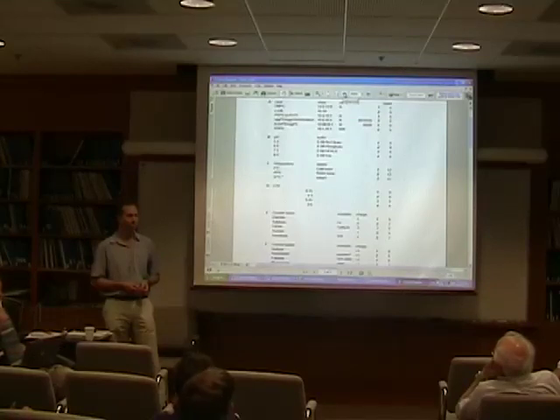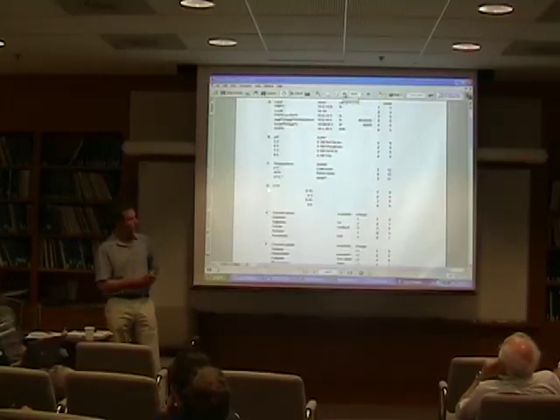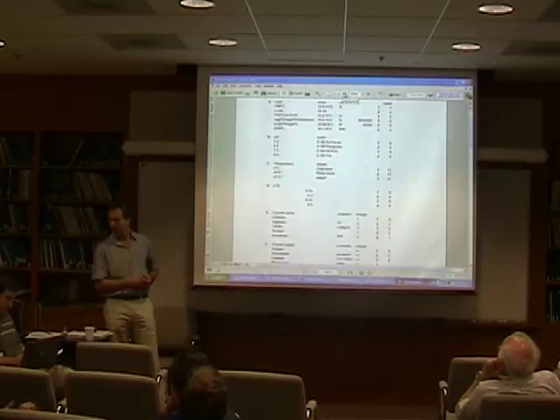Well, the answer, small, right? From right, set it up to 2. Yeah, but this is different at that point. This is actually really a crystallization screen. Should we increase the range? How much do you think? If it's supposed to be a crystallization screen, then I think I would at least go to 0.75.